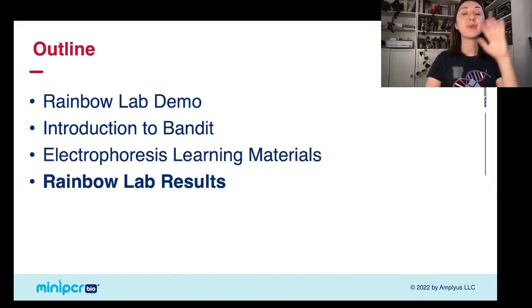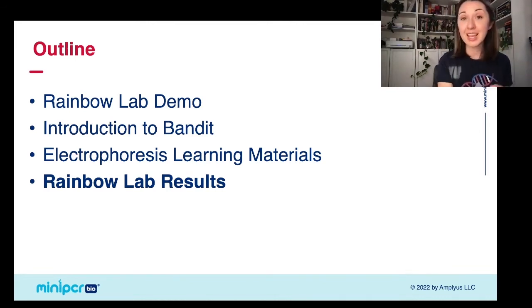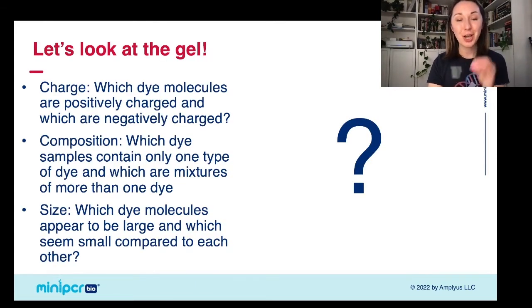Okay, so that was a lot of information. To recap, we're going to be able to tell three things about our samples by looking at our results. We're going to be able to tell their charge based on whether or not they moved towards the positive or negative electrode. We're going to be able to tell our sample composition based on if there is just one band in a lane or two bands in a lane. And then we're also going to be able to tell their relative sizes based on how far each molecule moved through the gel. So these are the three things we're going to be looking at here: charge, composition, and size.